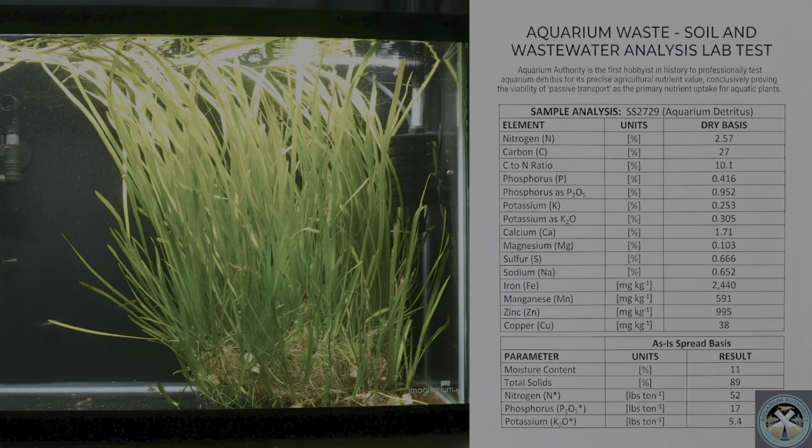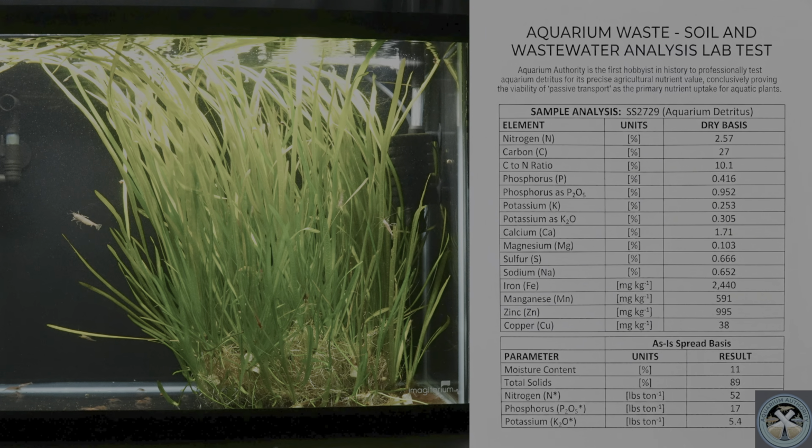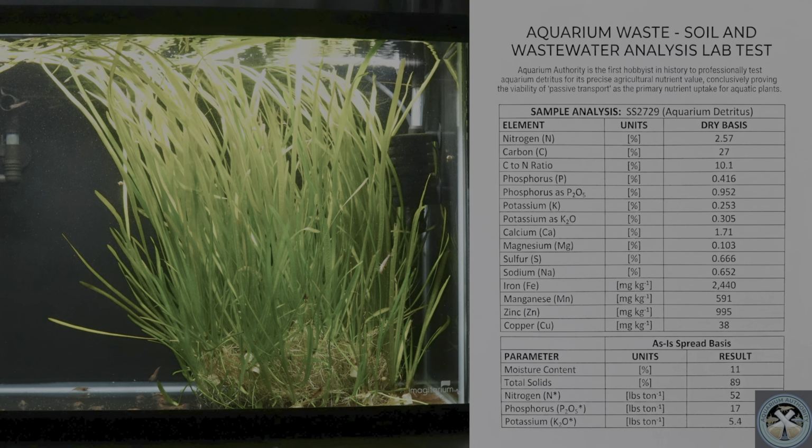Now, below that, we've got the milligrams per kilogram. And you're probably thinking, what the heck does that mean, right? These elements are present in such tiny amounts that using a percentage would look ridiculous. So if we were to translate, for example, copper, it would be 0.0038%. So instead, we use milligrams per kilogram, which gives us a whole number that's much easier to read and compare.